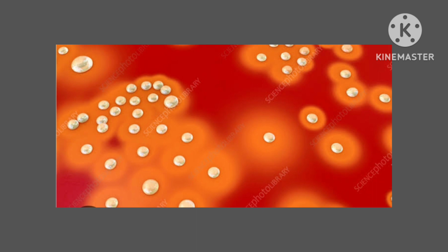Alpha, beta, gamma and delta hemolysins are produced. All these hemolysins produce beta hemolysis. Let me tell you about alpha hemolysin. Alpha hemolysin produces beta hemolysis, which we see commonly around the Staphylococcus aureus colonies on blood agar. This property is best seen with rabbit blood agar. They lyse RBCs and polymorphonuclear cells.